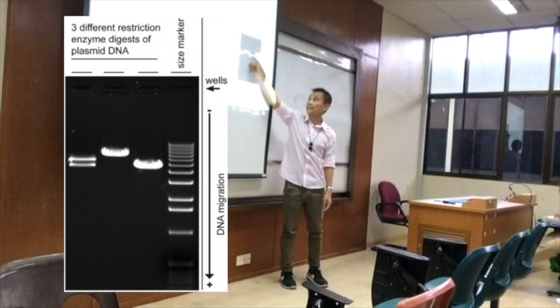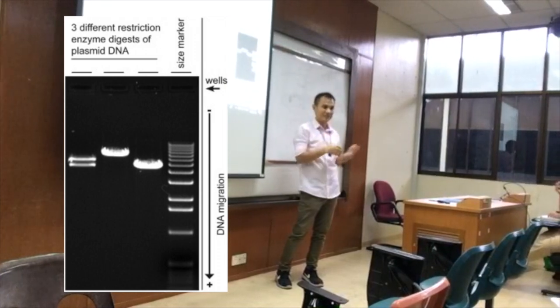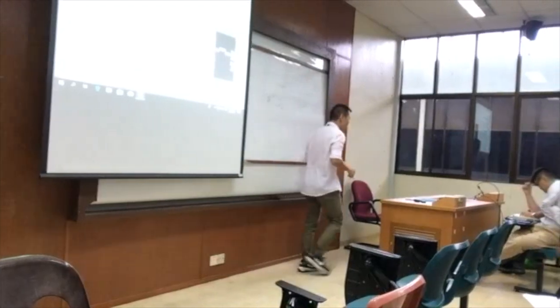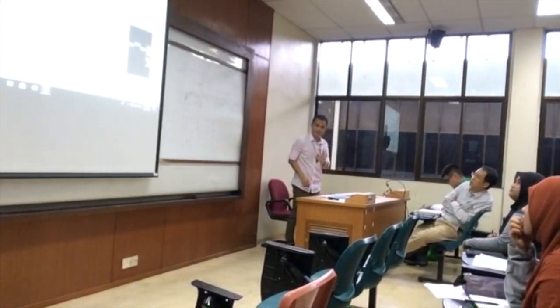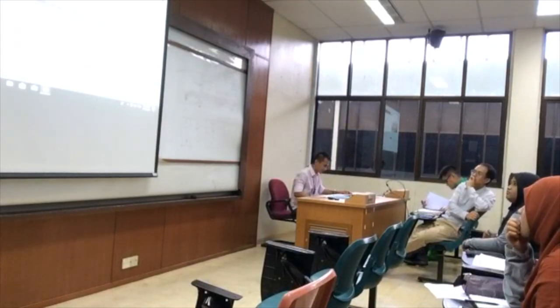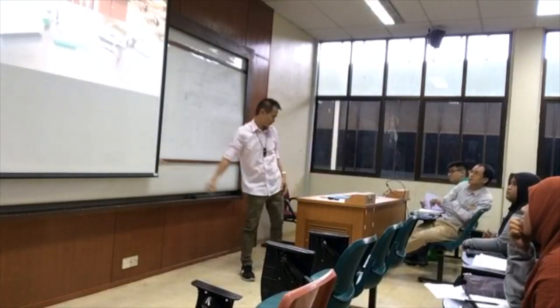And once you know this one, you can take out this one, and you can send it for sequencing. And you come back with the results, GATC, and so on. Okay, so we're going to see how you perform the first. We have done the polymerase chain reaction, yeah? And then we're going to see how you do the agarose gel. So this is how we perform the agarose gel, the gel electrophoresis.